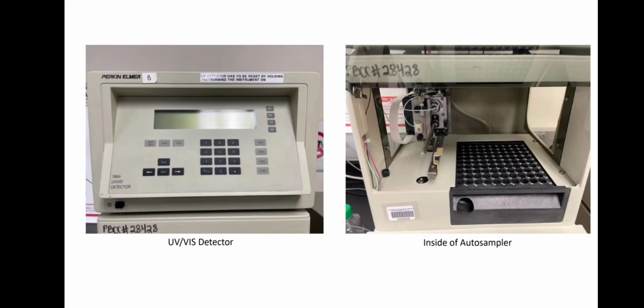First, you can see the syringe pump, which is responsible for precisely injecting the sample into the system. The syringe pump works in conjunction with the autosampler to ensure an accurate and reproducible sample introduction. Next, we have the column, which is the heart of the HPLC system. This is where the actual separation of the mixture's components takes place.